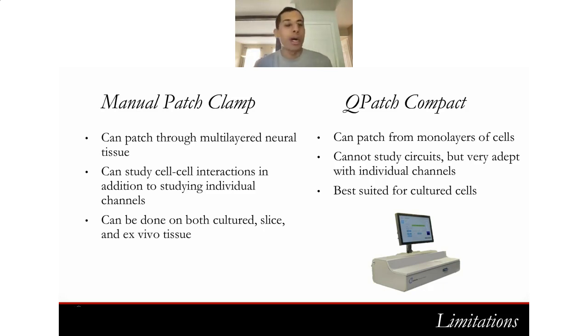But QPatch is better for monolayered cells. And so because of that, it's more useful to study the activity of individual channels and the properties of those channels rather than looking at circuits. But it serves a really great purpose.